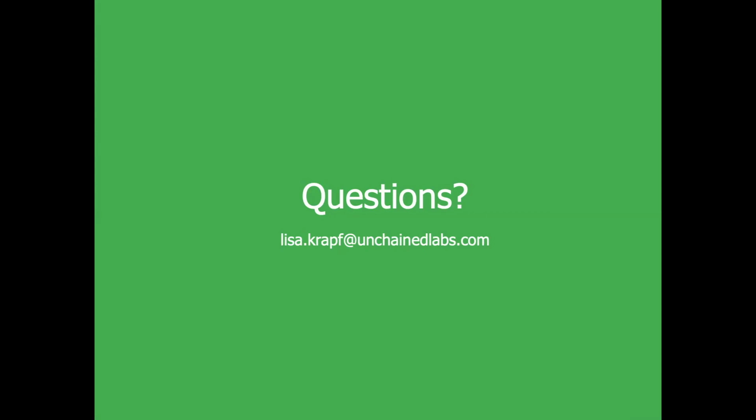Okay, great. Thanks, Lisa. Lisa, if I have a Raman library from another spectroscopy instrument that I want to compare my samples on the Hound to, is that possible? Can I use databases or Raman spectra for matching from another instrument or from a tool I already have?